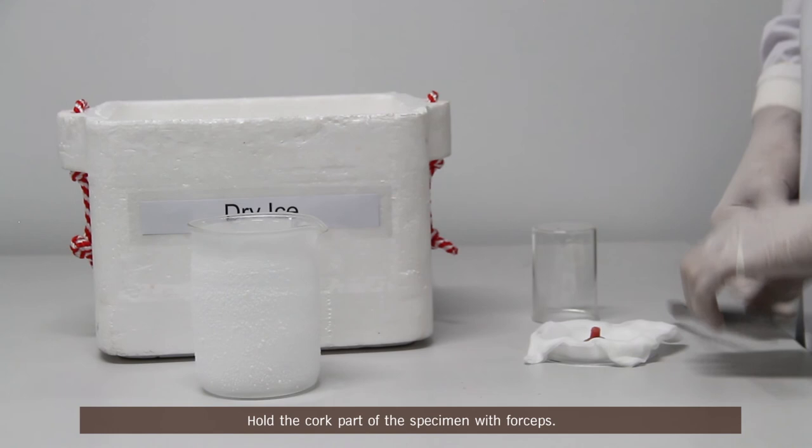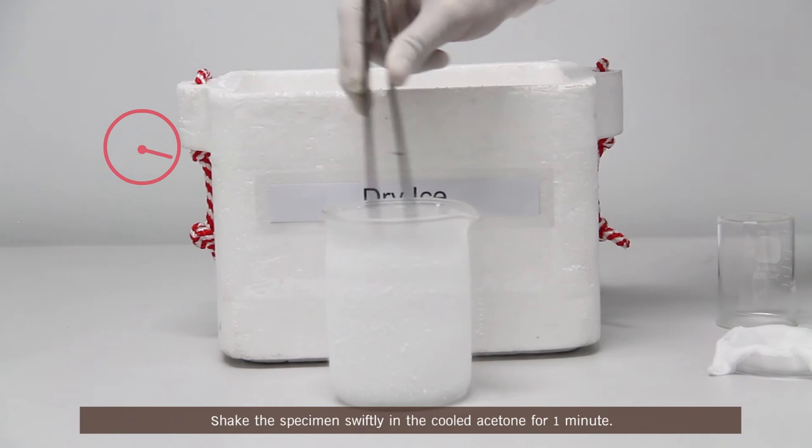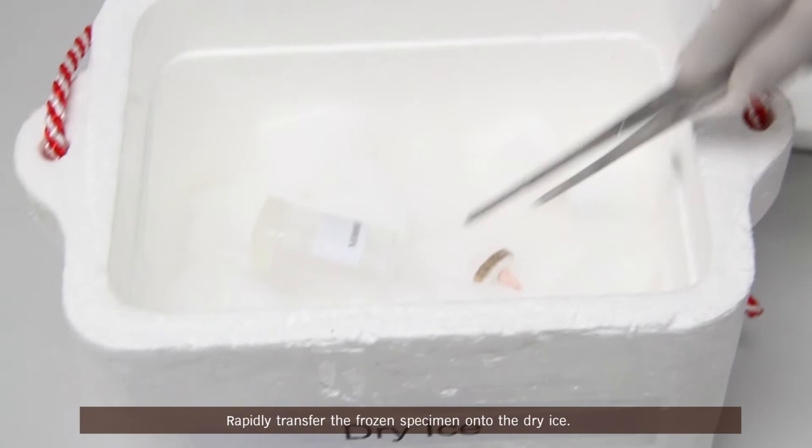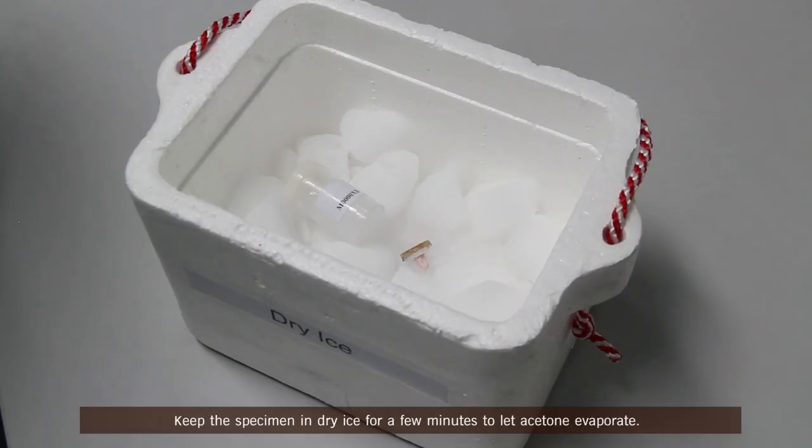Hold the cork part of the specimen with forceps. Shake the specimen swiftly in the cooled acetone for 1 minute. Rapidly transfer the frozen specimen onto the dry ice. Keep the specimen in dry ice for a few minutes to let acetone evaporate.